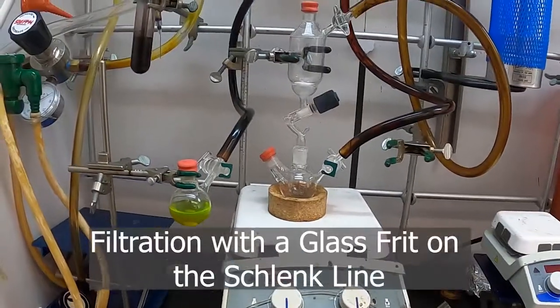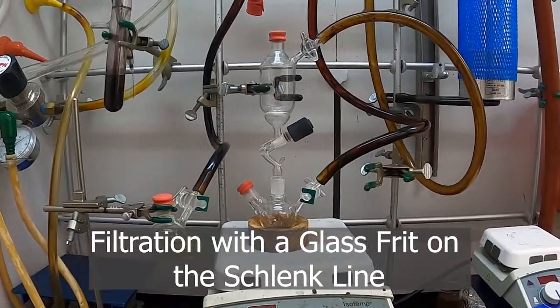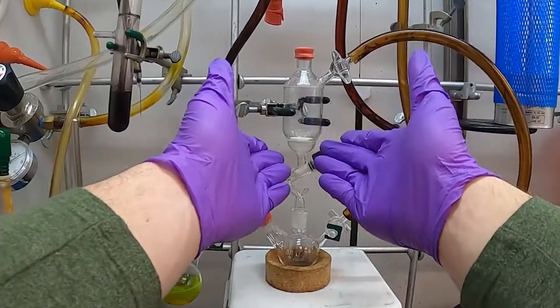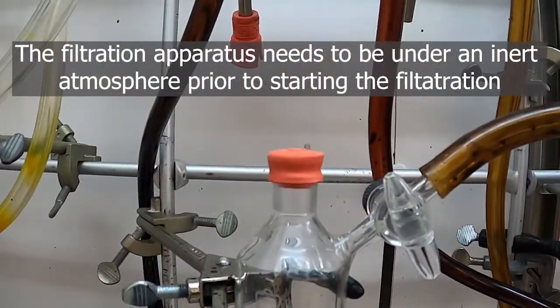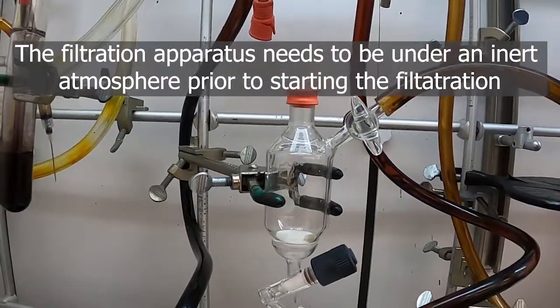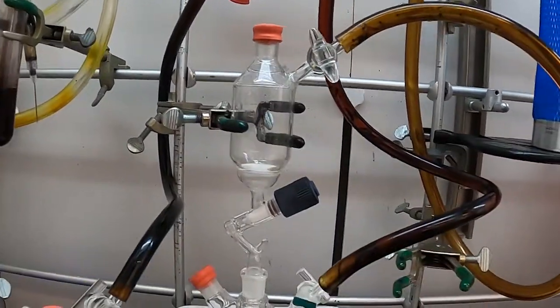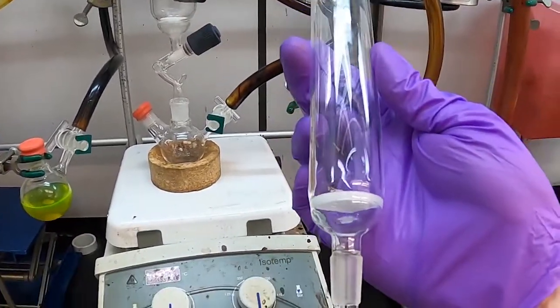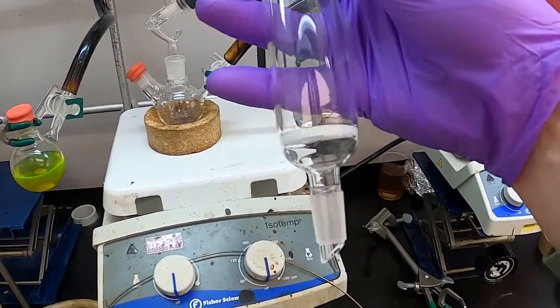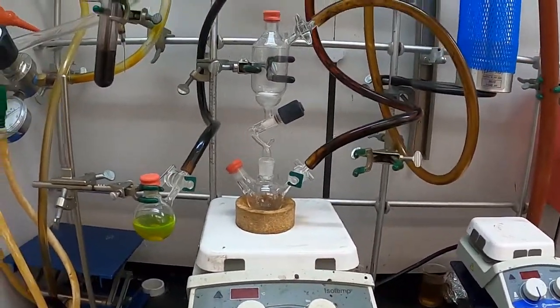Another method we can use to separate solids from liquids under air-free conditions is using a special frit designed to be used under inert atmosphere. It's a frit that's kind of like a Schlenk flask. There are different types — this one has a Teflon stopper so we can control when things go through the frit. There's also another style that doesn't have that, so anything you put in immediately passes through the frit.